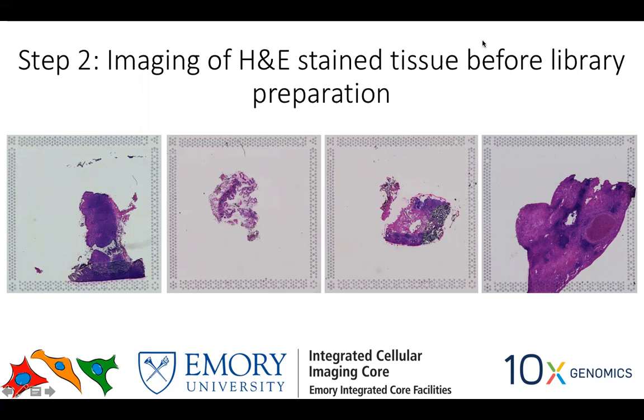So should I do the optimization staining first and run it by you, and once that is ready, then thaw this second slide and go through everything? Or do you prefer that we do both slides at the same time? No, definitely. You would do this in 2 different successions.